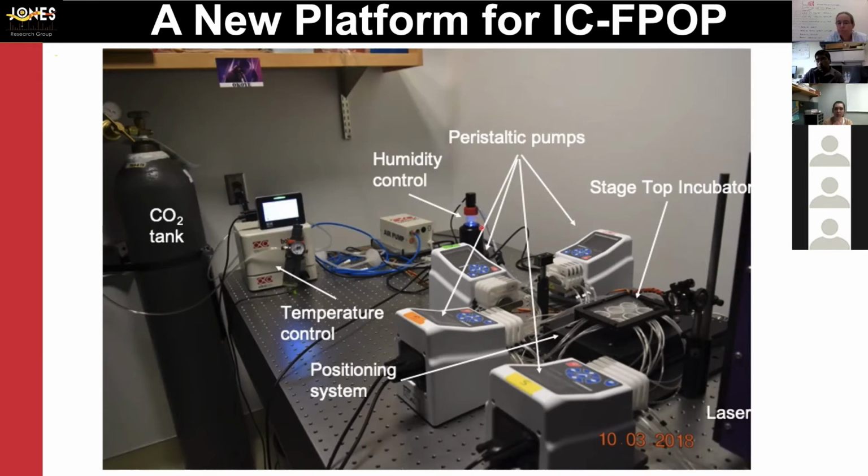So this has been very nice. And what we found with PIXI is we can actually label each sample in 20 seconds. So we've gone from the flow system at 10 minutes down to 20 seconds. We did want to see if we can get that faster, especially to look at protein folding over time in a cell. So we did automate this system.